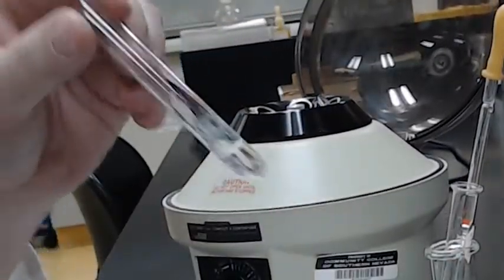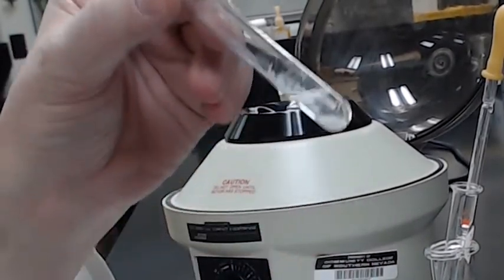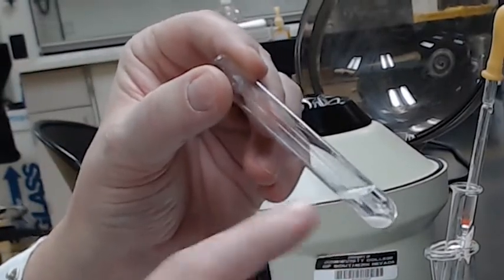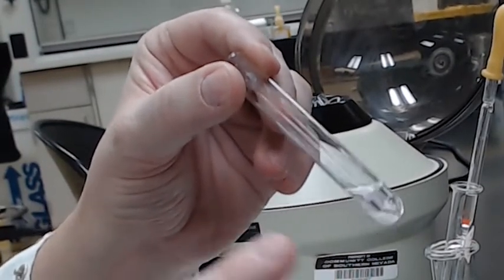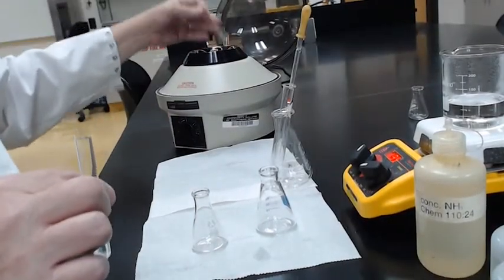Okay, and if you look carefully, our precipitate is on the bottom, and above it is called the supernatant. The supernatant should contain, well, obviously it contains ammonium ions now because we've added ammonium, but if there's any sodium, potassium, and hopefully the magnesium, if it's there, is in the supernatant. The precipitate here on the bottom should contain our calcium and or barium. Okay, and so the job is to separate.